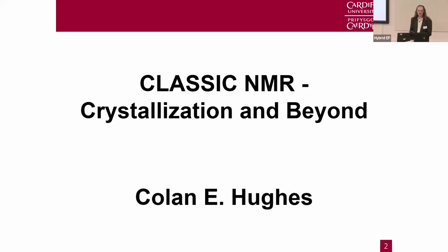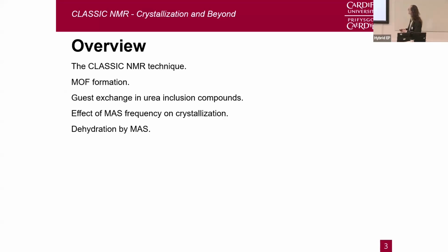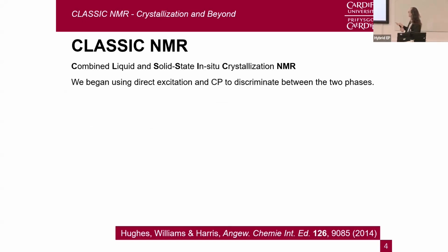So yes, classic NMR, crystallization and beyond. First of all, I better tell you what I'm going to talk about. I'll explain quickly what classic NMR is, what the technique is, and then I'm going to look at 4 different applications that we've done over the last few years, most of which, but not all, have been done here on the 850.